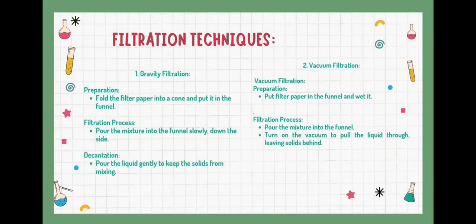Filtration technique. Gravity filtration. Preparation: fold the filter paper into a cone and put it in the funnel. Filtration process: pour the mixture into the funnel slowly down the side. Decantation: pour the liquid gently to keep the solid from mixing.